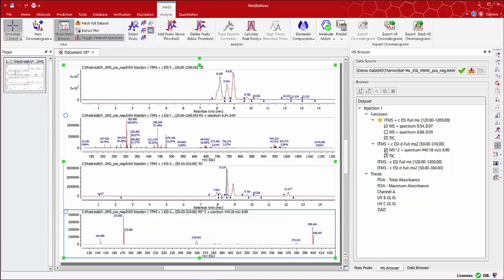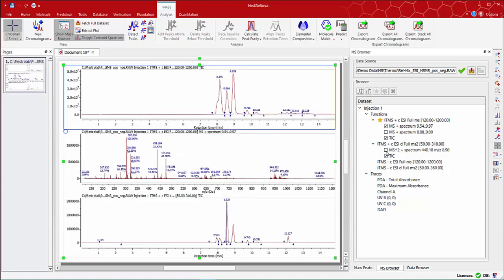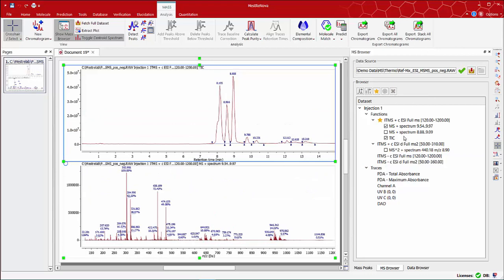Back to the MS Browser panel, you can use the boxes to turn on and off the display of the different traces. You can also highlight any of them and use a delete button to remove them from the display.